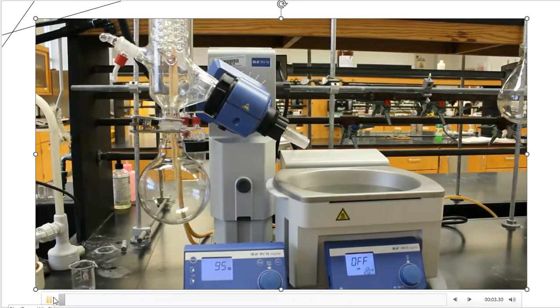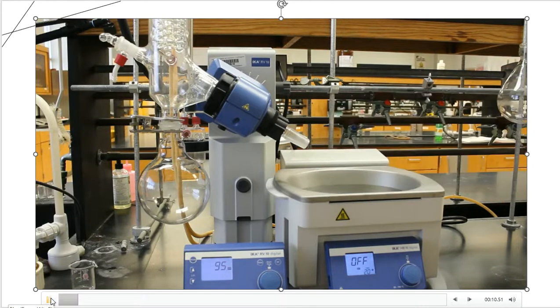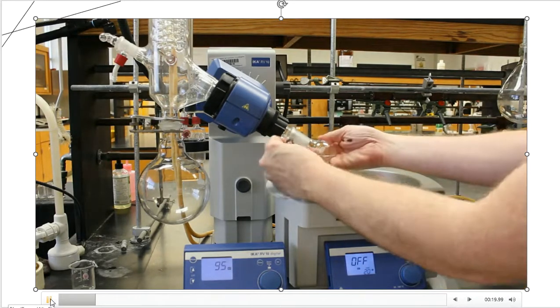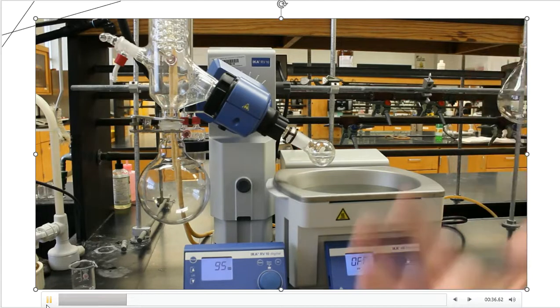All right, in the next step of the anisole lab, it tells me to distill off all of the methylene chloride. So basically what that means is that in the flask that I have here, we have this methylene chloride that's still remaining, and we need to get rid of it. So I'm going to put that onto what we call a rotary evaporator, and I'm just going to lock that boiling flask into place. This is an automated way that we can set up a distillation setup. So on the control panel, that makes my job very easy.